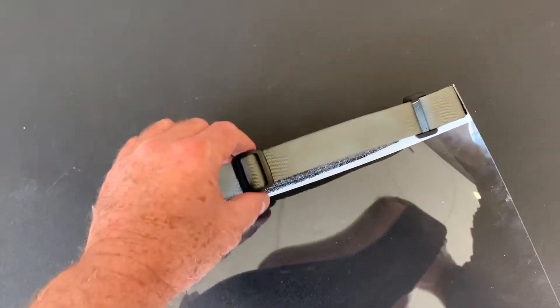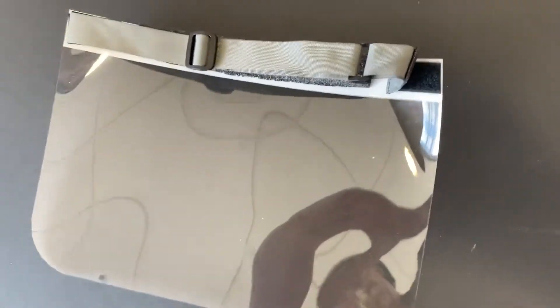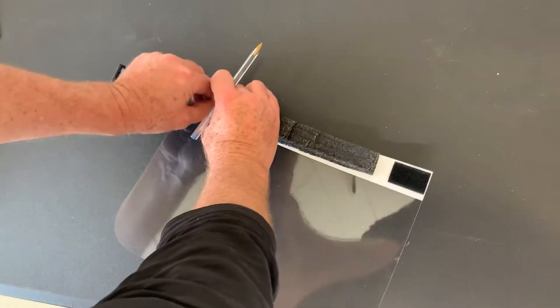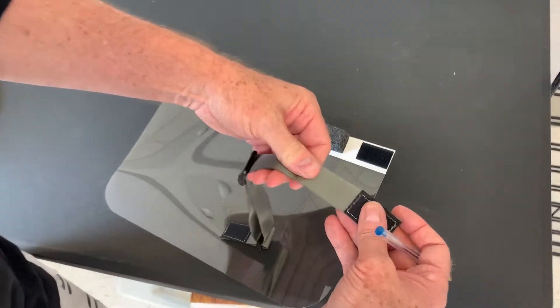On the back, we've got a removable strap — removable for cleaning purposes. This strap is adjustable and it's made out of nylon material.